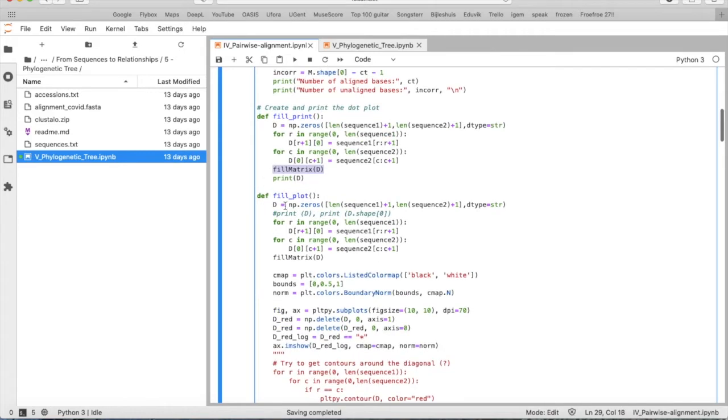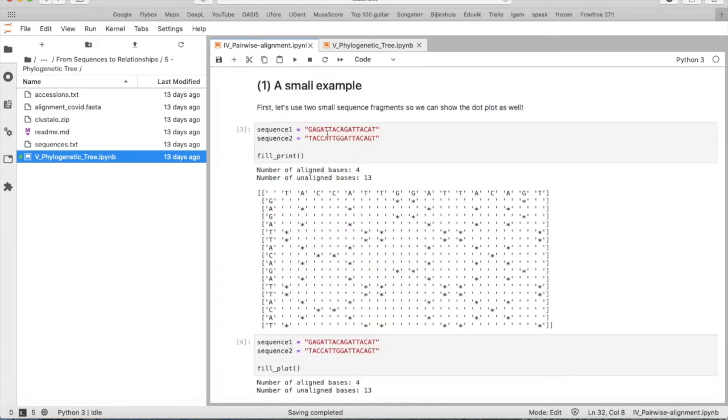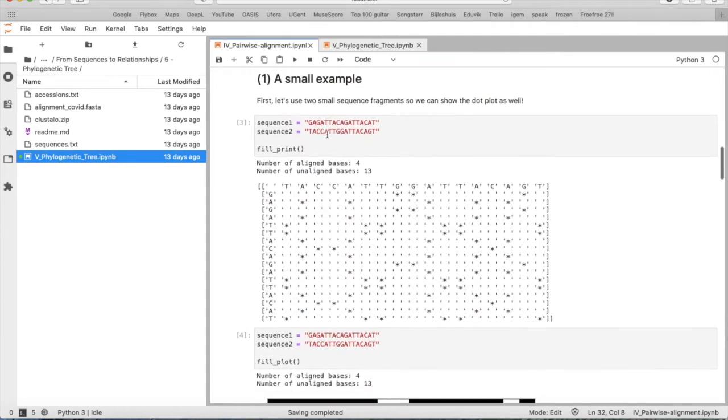The function fill_plot is comparable to fill_print, but here we will not print crosses or empty spaces, but we will print black and white spots. A black spot corresponds to a match, a white spot corresponds to a mismatch.